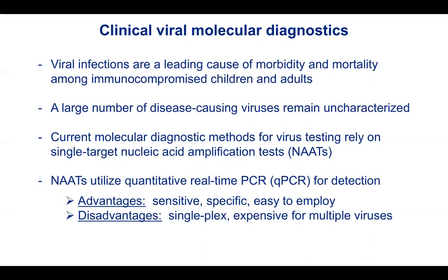These tests employ quantitative, real-time PCR for detection, which is a highly sensitive and specific method and the standard of care. However, qPCR assays are singleplex or low multiplex due to fluorescent reporter molecule availability and difficulties in optimizing primer probe concentrations.